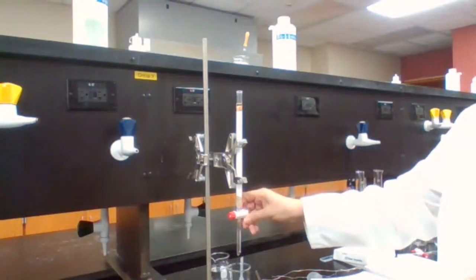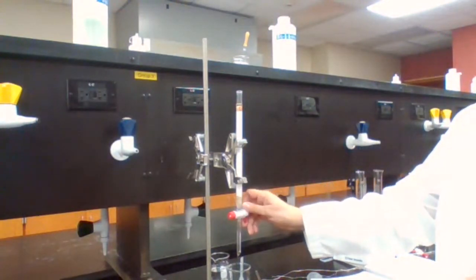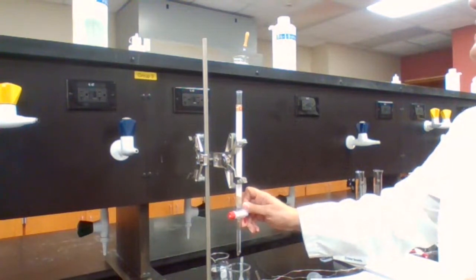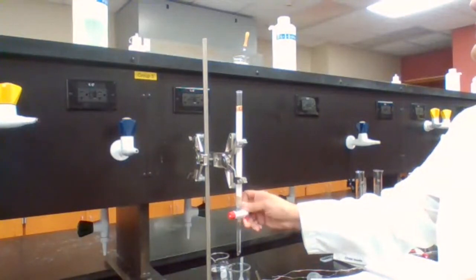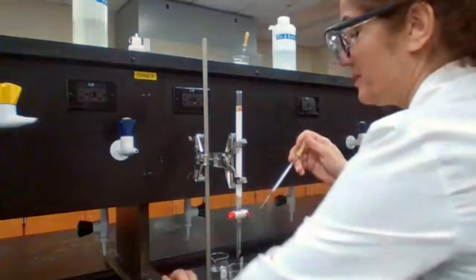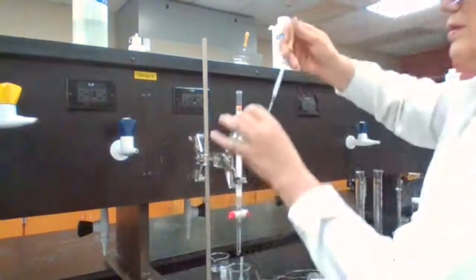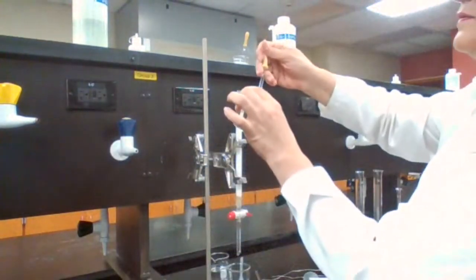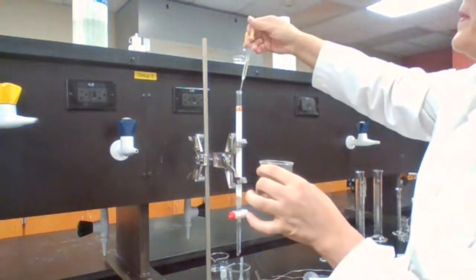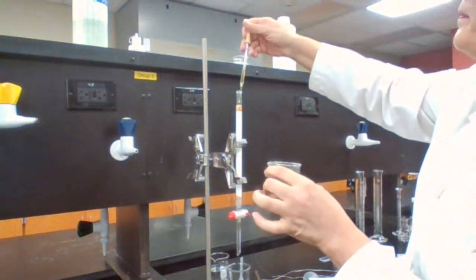The top of the sand. And you can write the next step while I'm doing this, so I know what to do next. What's the next step? I was lucky it didn't spill. The next step is to add the sample.